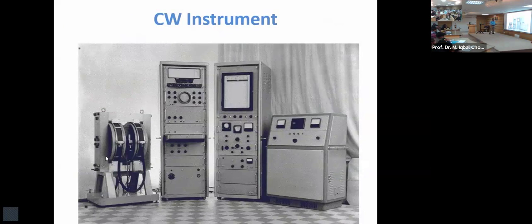And again, everything is the same, Larmor frequency. This is the radio frequency oscillator. You slowly increase the radio frequency. When it matches with CH3, we call it absorption. This is a paper chart. First absorption recorded. Then when it is increased, it matches with CH2, second peak recorded.